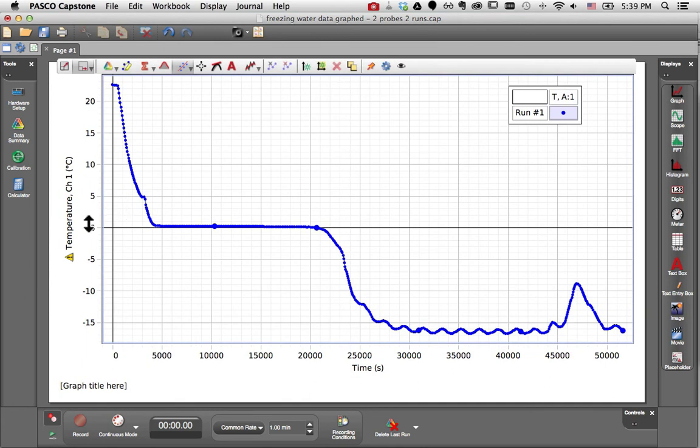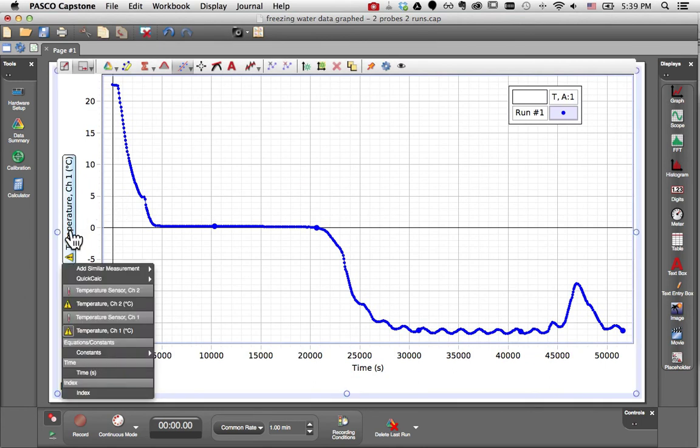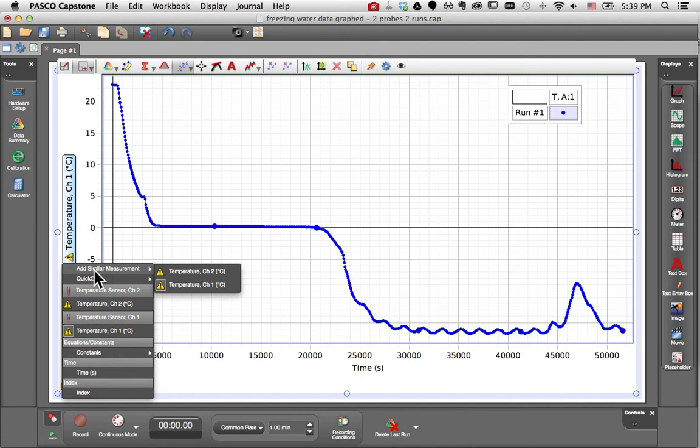The best way to do this in a graph is to go to the y-axis label, click on it, and choose Add Similar Measurement.